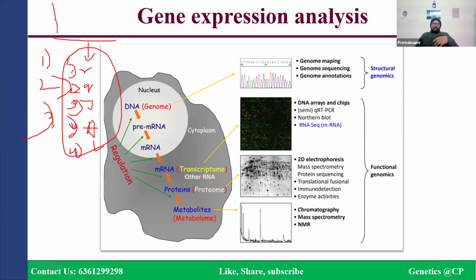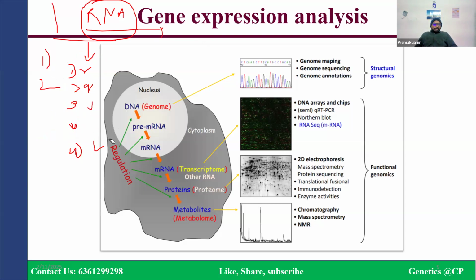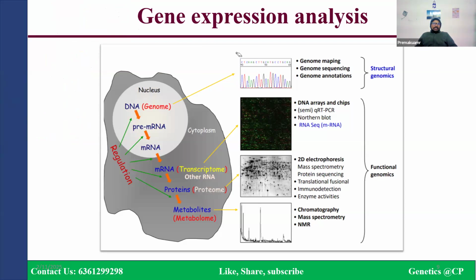Today we are going to discuss how we can sequence RNA, and how it can be used for gene expression analysis. Before going to that, we should understand what gene expression analysis is and what different techniques are available for gene expression analysis.